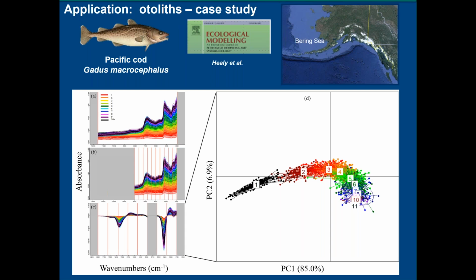Moving forward in our operational process, you're still going to have to update the model, and you're still going to require some traditional age estimation using microscopic evaluation. That's simply because you still want to enhance or support the expertise that you have in-house to estimate age from that method, but also because to update a model, it requires paired data of both microscopic age and the FT-NIR spectrum. So one thing is for certain: under an operationalized setting, you probably wouldn't need that many age readers.